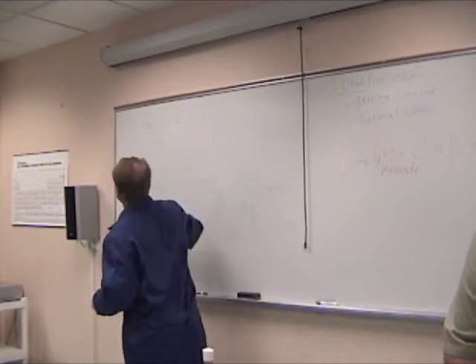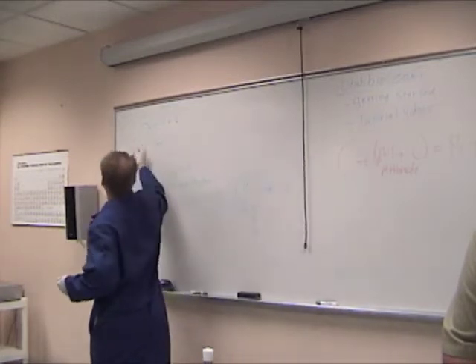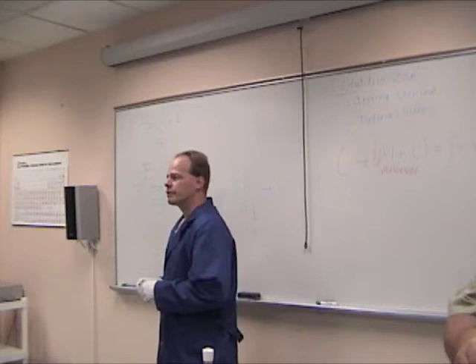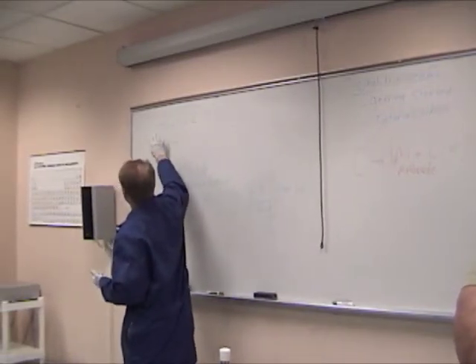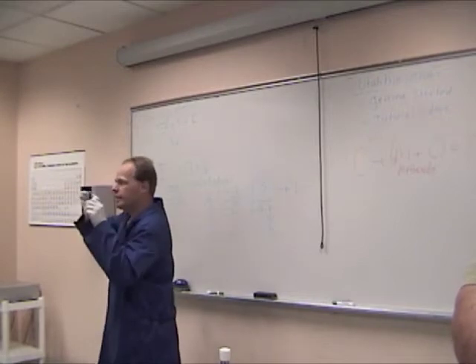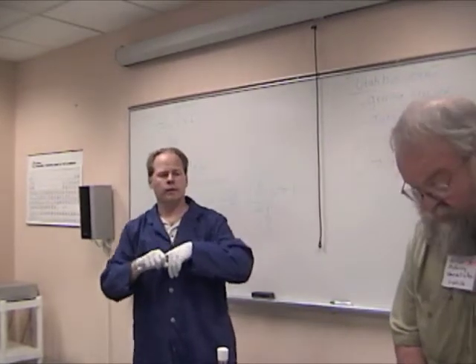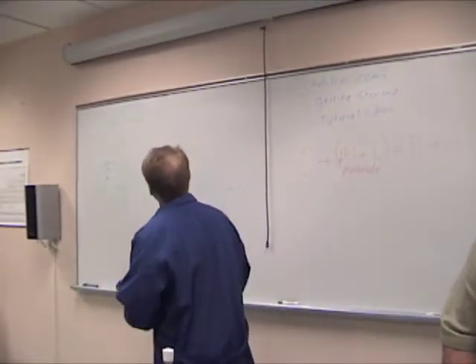Again, soap is not what we want, but unfortunately in nature, oils always have these broken out. There's a term called esterification using sulfuric acid, whereby I can actually modify that rose stem, recut it off, and allow the methanol to reattach to it. We're ready to go, Greg. We ready? All right. We'll talk a little bit more about that in a minute.